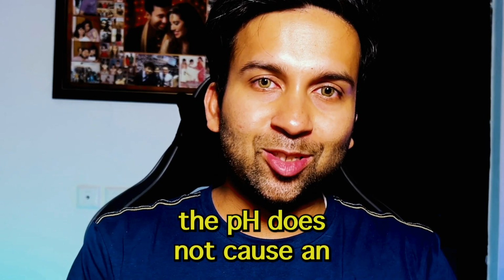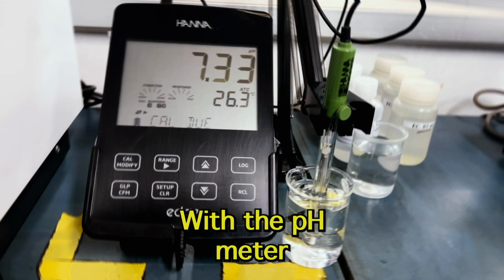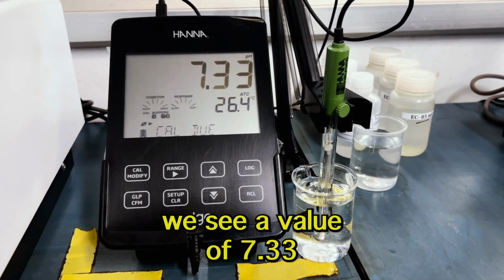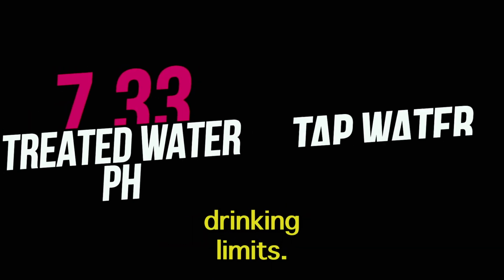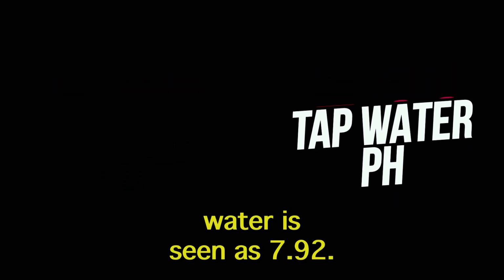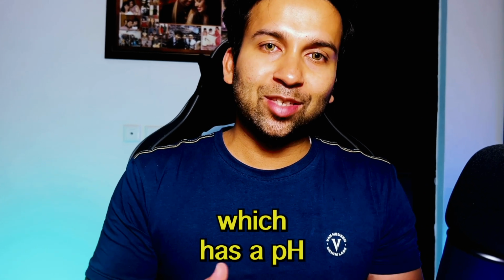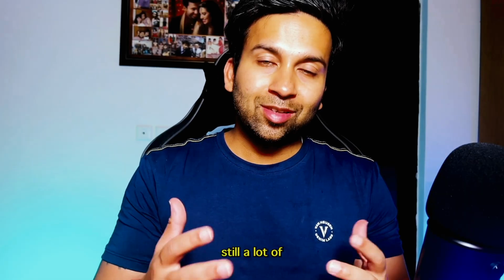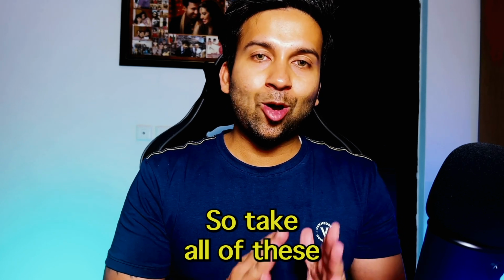Though the pH does not cause an immediate risk, it can cause skin irritations and rashes. With the pH meter, we see a value of 7.33 for the treated water, which is within the recommended drinking limits. Similarly, the pH of the tap water is seen as 7.92. There are a lot of proponents for alkaline water, which has a pH over 9.5. There are still a lot of studies yet to be done to prove its worth, so take all these with a grain of salt.